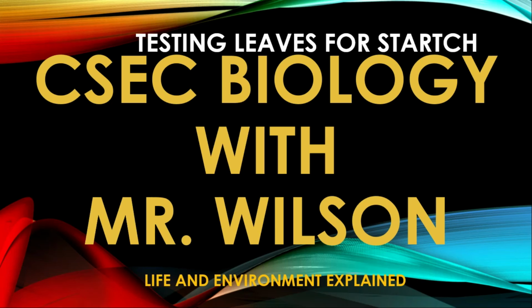Wilson. Today we'll be testing a leaf for starch. I'll be taking you through the lab, explaining some key steps in the lab, so you want to watch this video in its entirety. Let's hop on into what we're expected to cover before the lab, and then we are going to be looking at the actual lab, and then you are going to go on and do the write-up for the lab. So let's go.